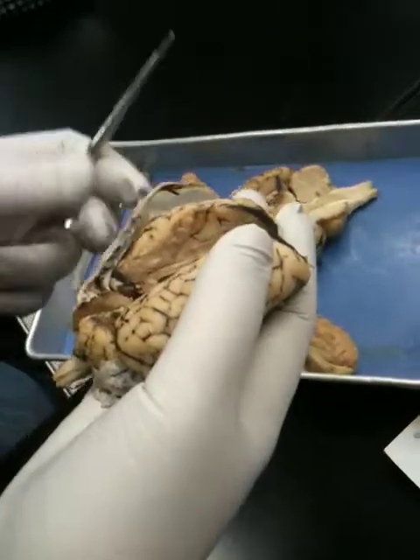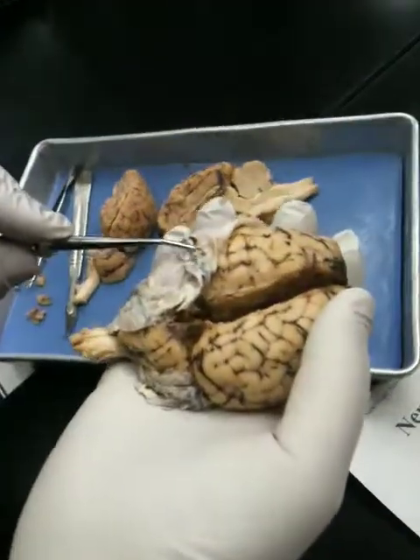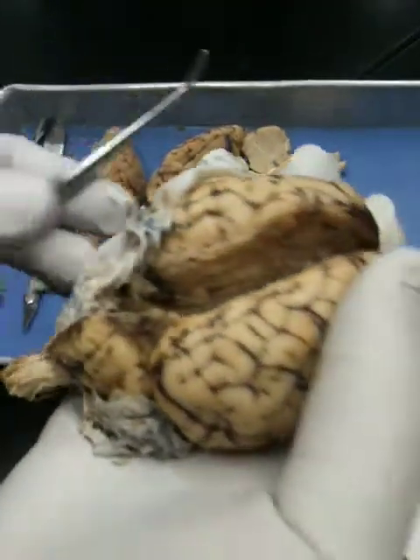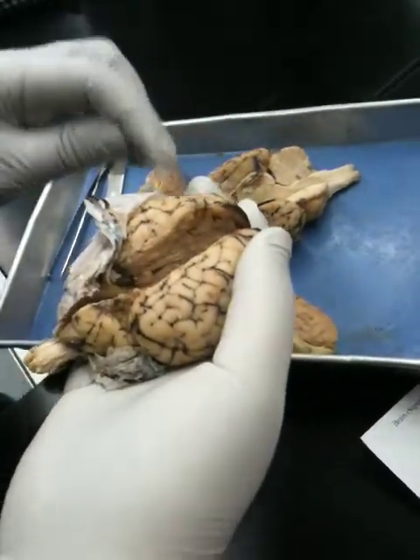This is going on YouTube, you guys. So it's right here. Arachnoid trabeculae — right there. On the pia mater, it follows the contours of the brain, so you don't really see it.